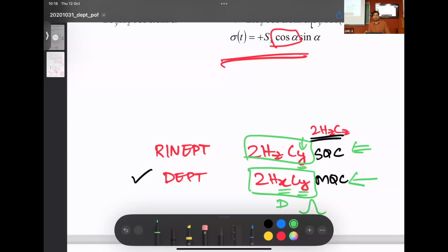Phase distortions have a very big problem. You cannot determine the chemical shift maximum properly. Chemical shift is a very important parameter with which people qualify their molecule. The moment you have phase distortion, picking a peak maximum, you'll soon realize it's not the right chemical shift. It'll be slightly moved away from the peak maximum. That's a problem, because people will report different chemical shifts for the same molecule. So people do not like phase distortions in their spectrum. We would want to avoid that first because your chemical shift will be misreported, which is the most important thing we want to report as spectroscopists.